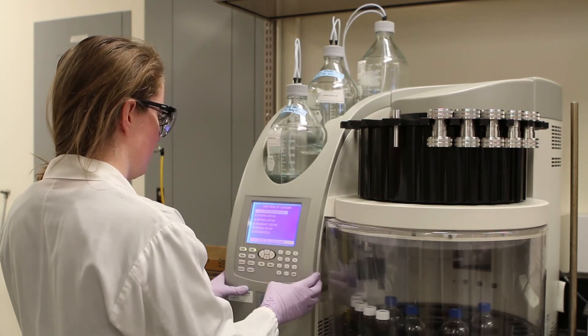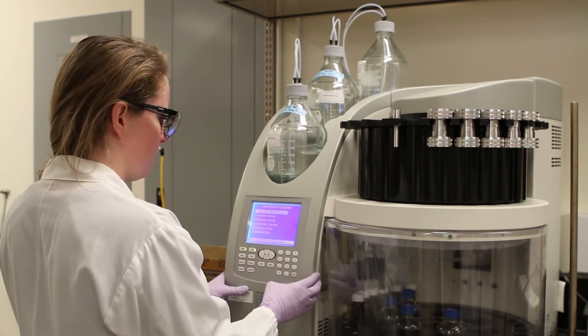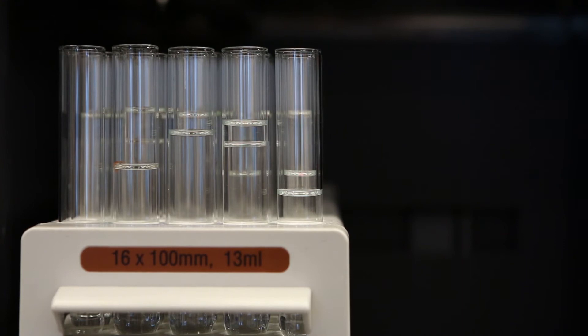In the synthesis lab, what we offer is equipment for people to come in and use, and this is all focused on synthesis of compounds or natural product isolations.